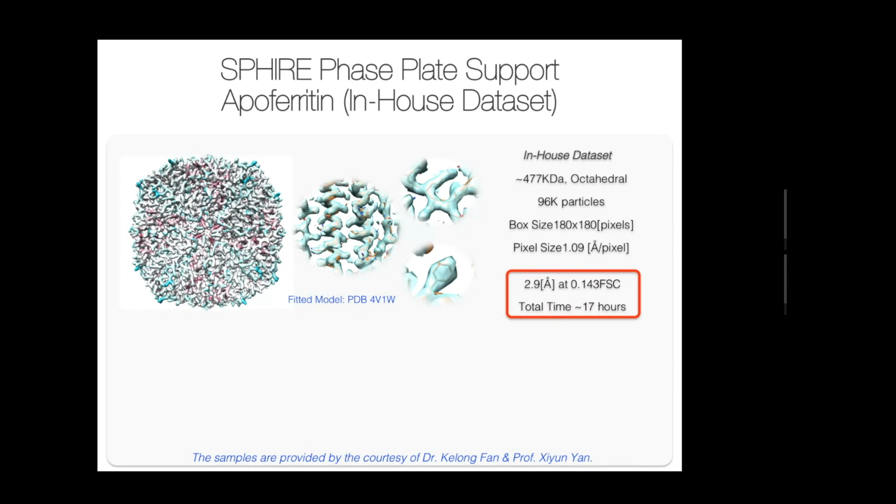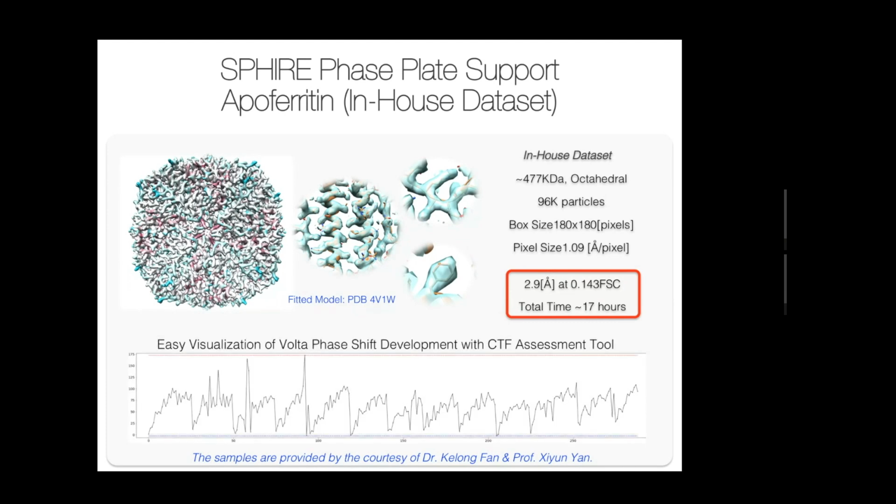Furthermore, we support the easy visualization of the phase shift development with the CTF assessment tool. These results prove that our SPHIRE pipeline is capable of near atomic reconstruction for typical SPA projects.